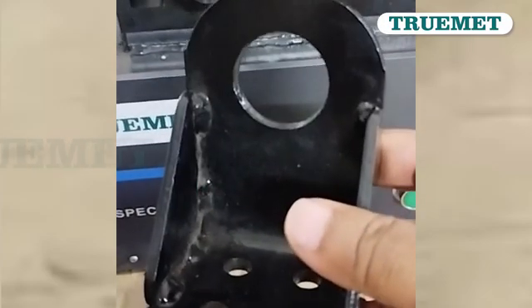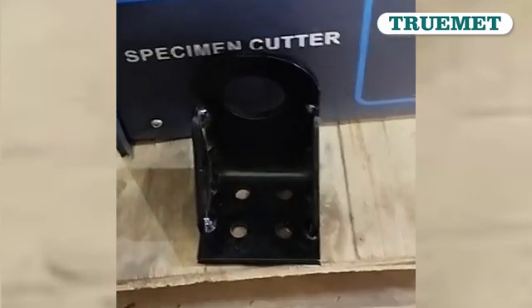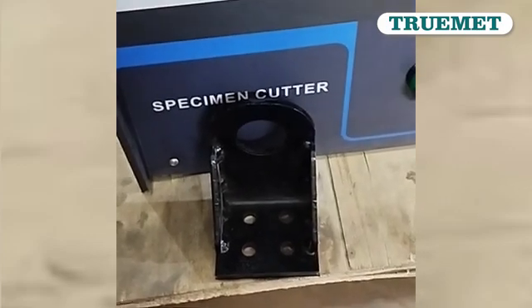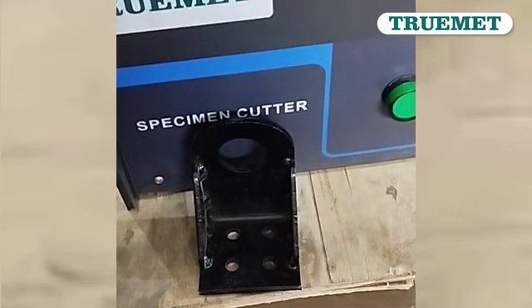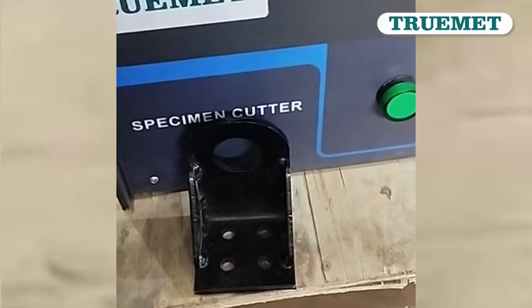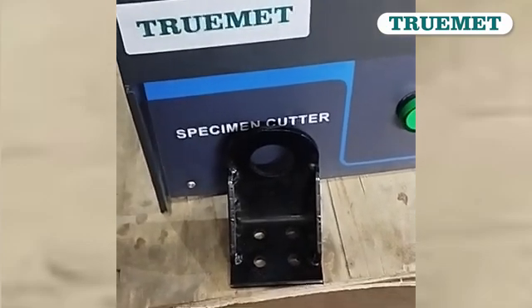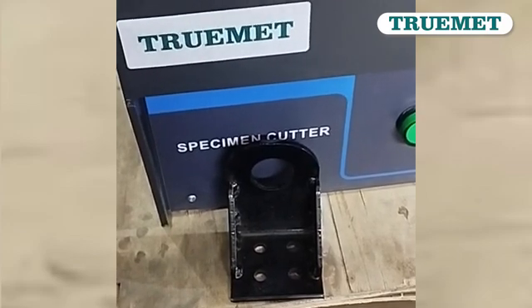First, the cutting of the component. So we require to cut the sample of the welding part. After that, the second process is polishing of the component. Third process is etching of the component, and fourth is weld penetration inspection measurement on our software. So we are going to show you the complete procedure.